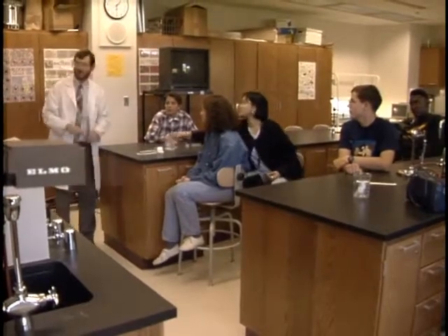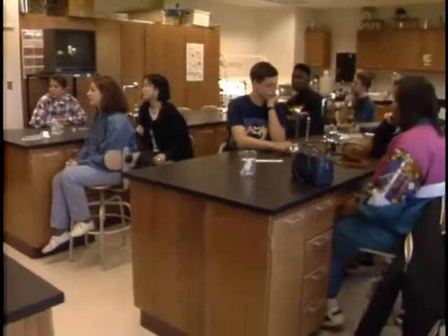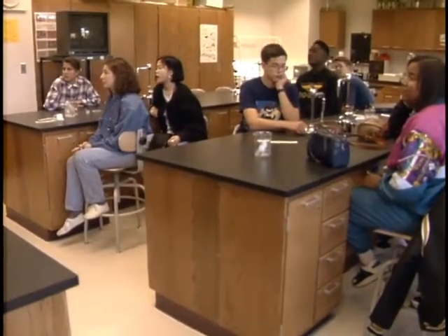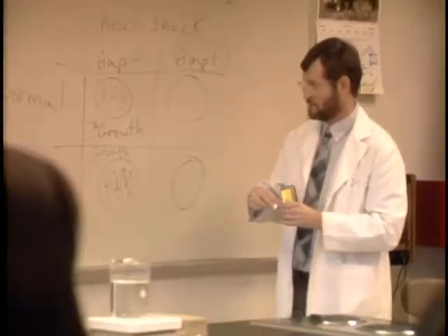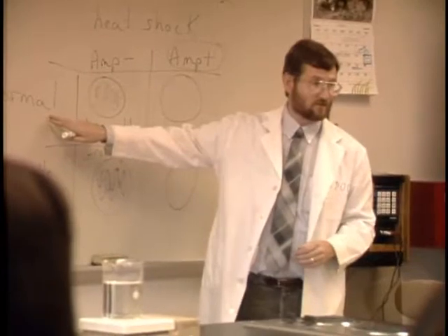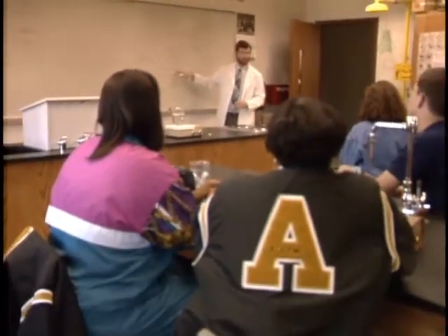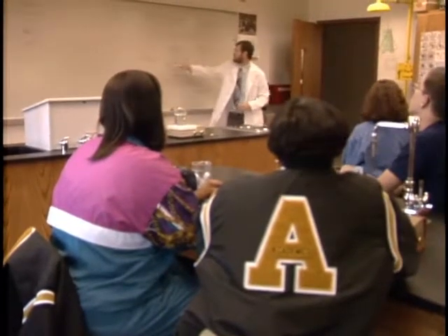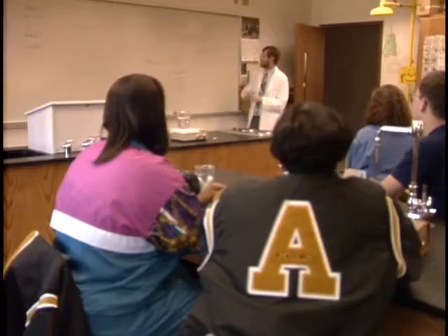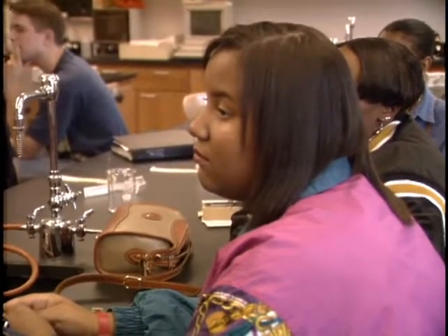Now, the one thing we could take a look at is our sketch up here in terms of what we were expecting to see as far as the growth goes, as far as the responses. Okay, so if we have the normal cells and we're putting them on the ampicillin minus plates, we're going to get the growth. And if we take the normal cells and put them on the ampicillin plus plates, we're going to get what? Clear. Clear, okay. Ampicillin-resistant cells that we put on the ampicillin minus plates will get growth.